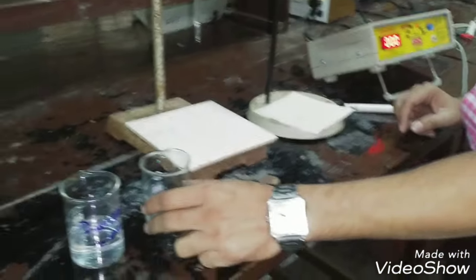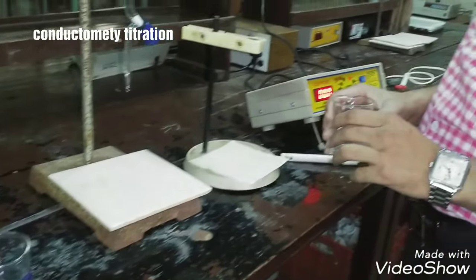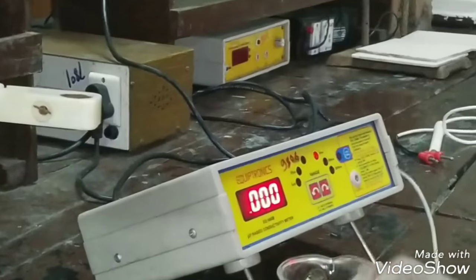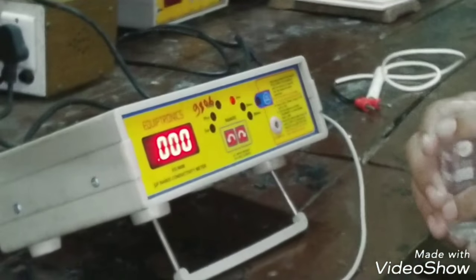Hello everyone. Today we discuss conductometric titrations and its type, particularly strong acid versus strong base.